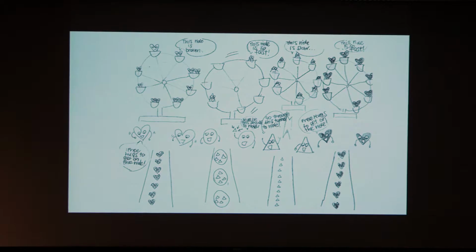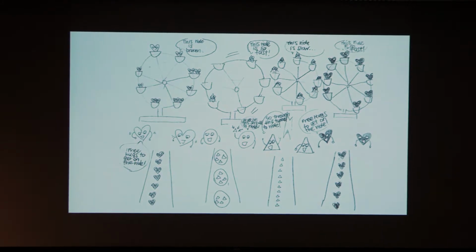But on the right side, for the gold nanoparticles, it still says this ride is so fast. Gold doesn't have the toxicity of silver in terms of killing the cells, so it wouldn't be effective if you insert it into the yeast cells to kill them.